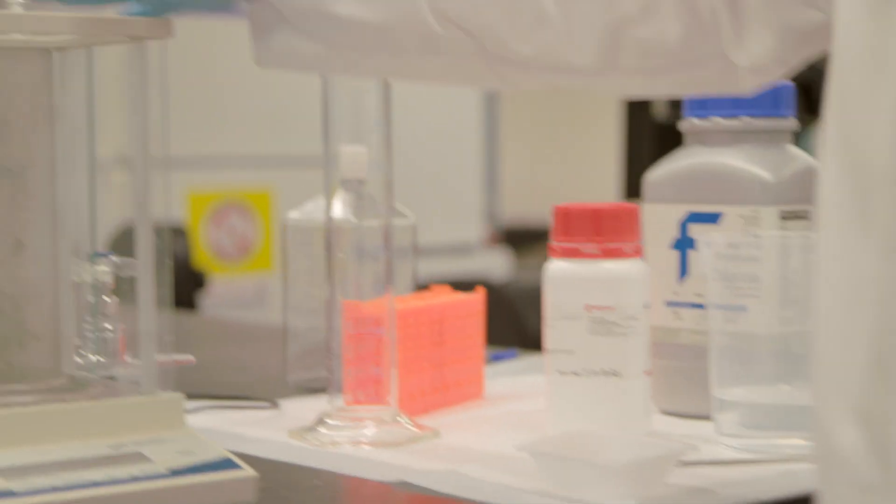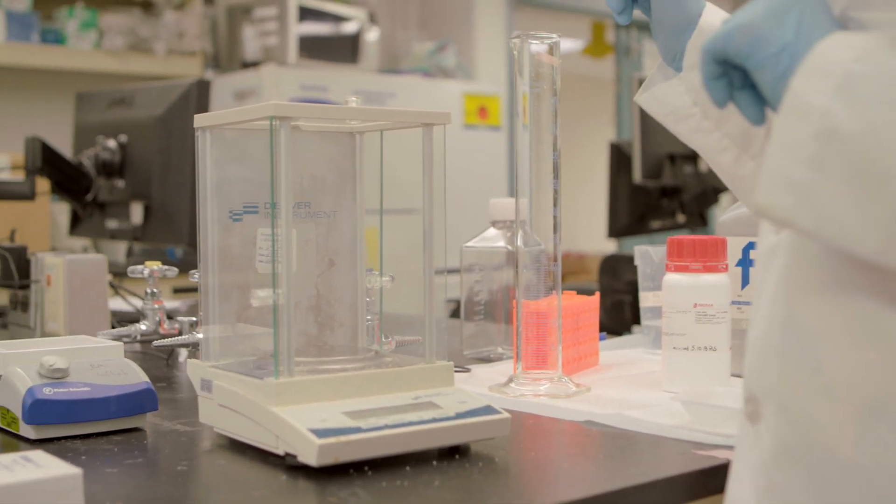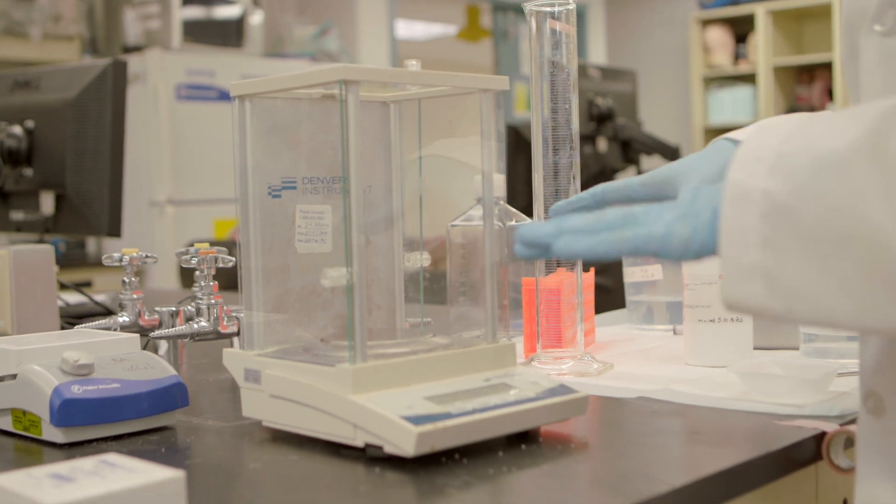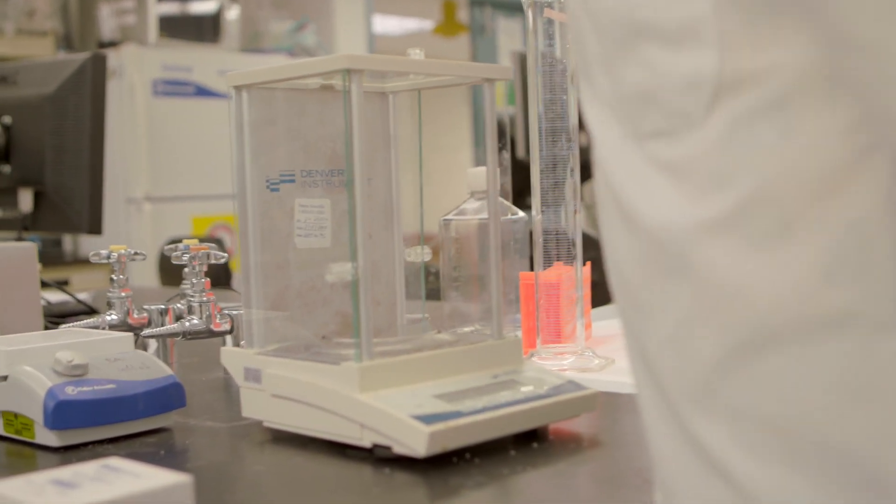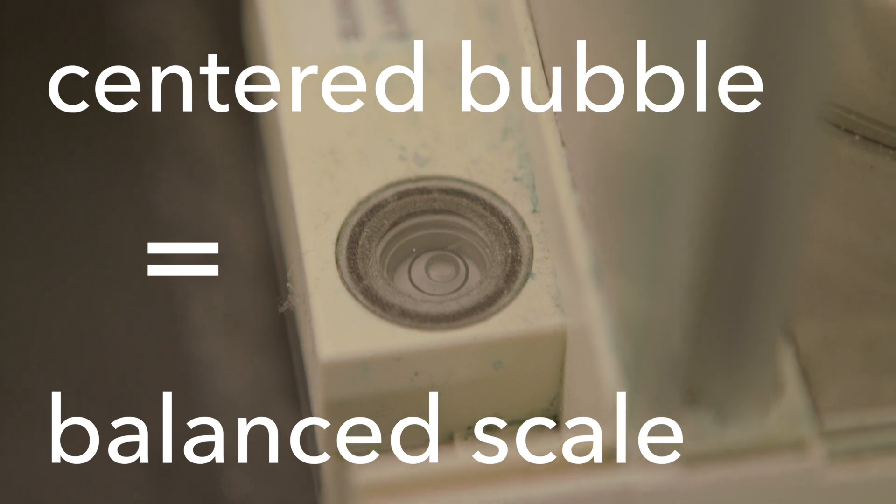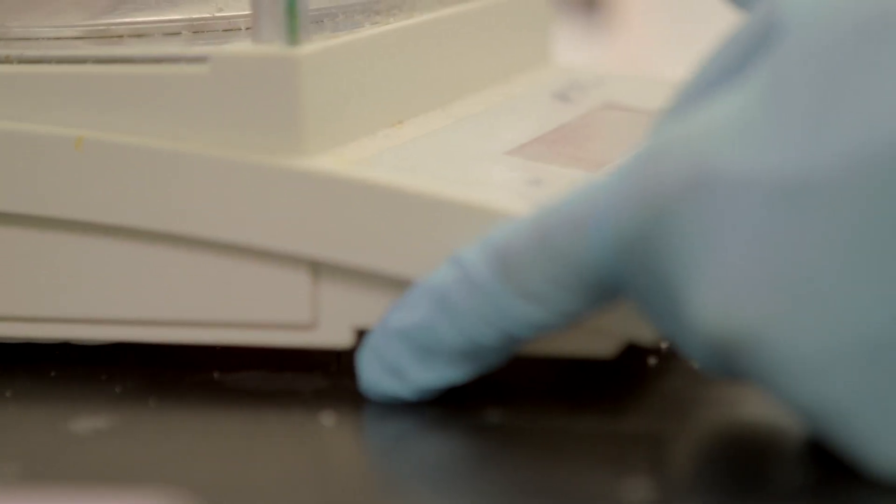Here is our scale that we're going to measure. The first thing I always do when I come up to one of these is check to make sure that it's actually balanced. All scales in some location will have a level on them, and this one happens to be on the back. You want to make sure that the bubble is centered in the circle, and then you know your scale is balanced. If it's not, I can adjust it. The adjustment on these scales is usually two feet that move, so moving them forward or back will adjust the location of that bubble.